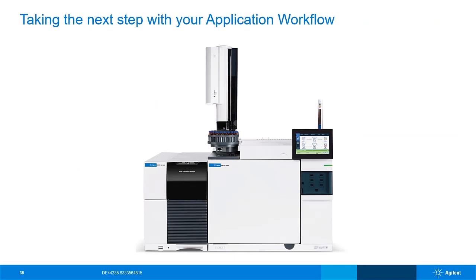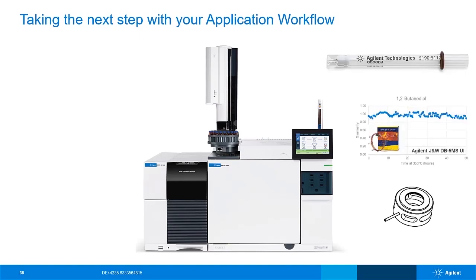To pull our discussion together today, we've tried to provide some insight into optimizing your application. Using the right liners and columns for your application and setting up the mass spectrometer to get the most out of each run can lead to better data, sensitivity, and improved performance.